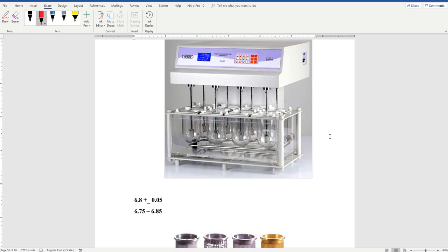In case you want to take multiple points, in this case, if you take for example a sample here, let's say 5 ml or 10 ml sample from each vessel, you need to replace it with the same medium at the same temperature. If I took 5 ml containing the drug in solution from here, then you need to take medium that has no drug and put it back, but it has to be at the same temperature.